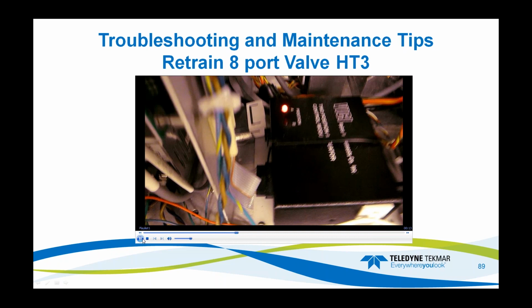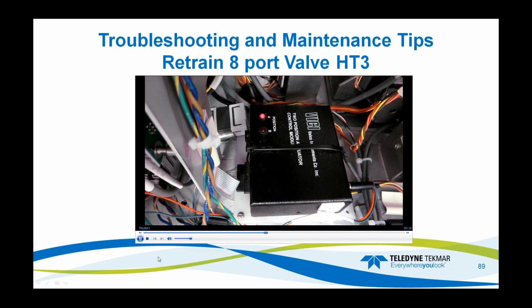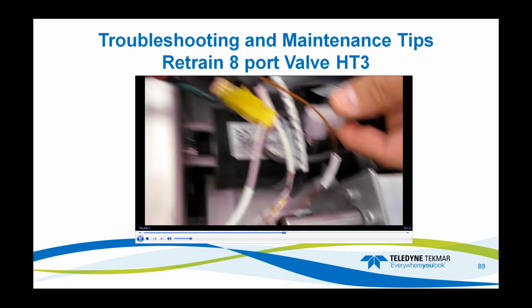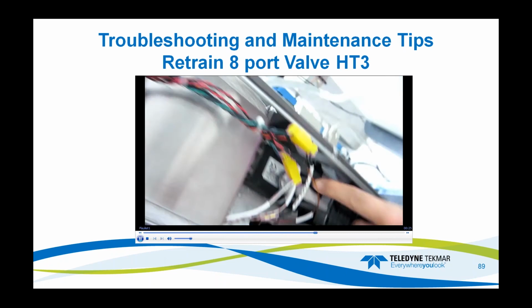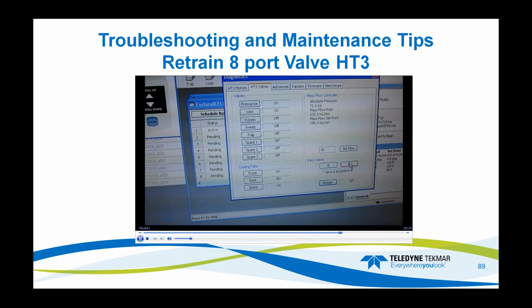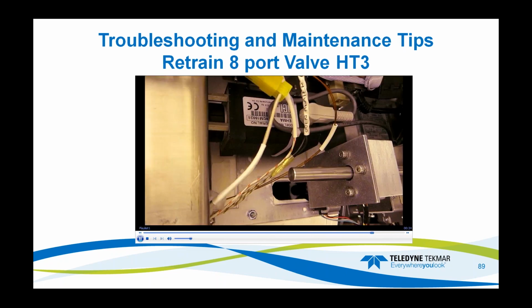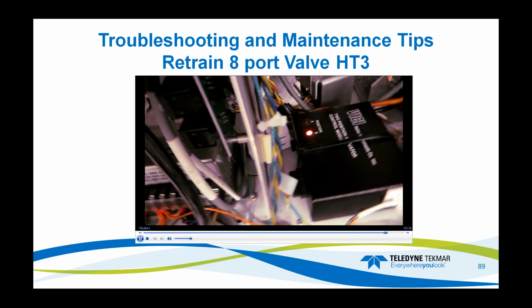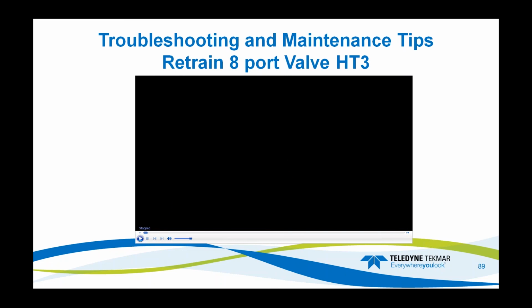You'll see the lights change. When you've done that a couple times, then you will plug the connector back in, and you will re-switch the Valco valve again, and you will hear a sound difference. It'll be kind of a low-grade grunt, and then it'll turn to a very crisp click, and that's when you know that you've retrained the valve properly. Again, this is something for your information. Talking to tech support at the time would be helpful.